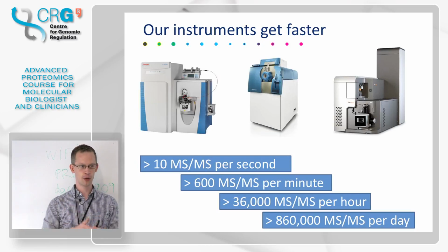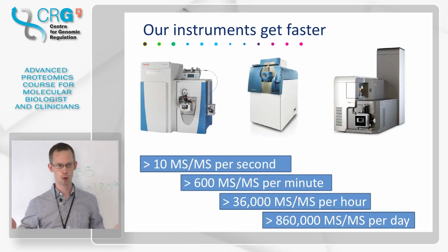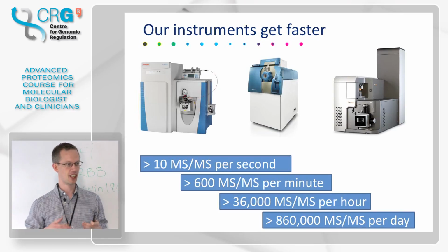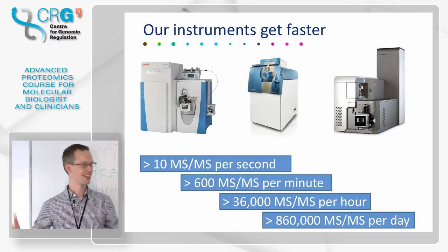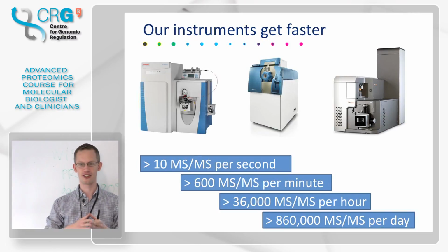And often we fractionate our samples, so they run for maybe a few hours, or maybe a full day, maybe multiple days. So for just one sample, we can have a lot of spectra. This fits with what we're trying to do: describe all these proteins or proteoforms. And we need computers now, because there's no way that we can sit down and do this manually.